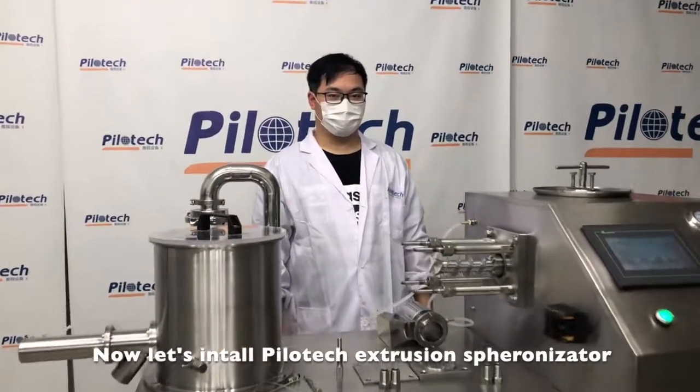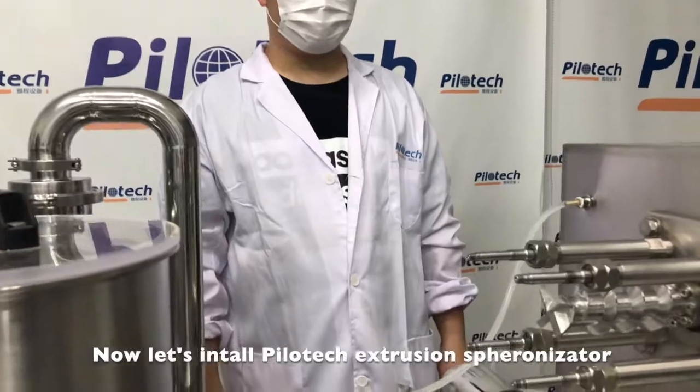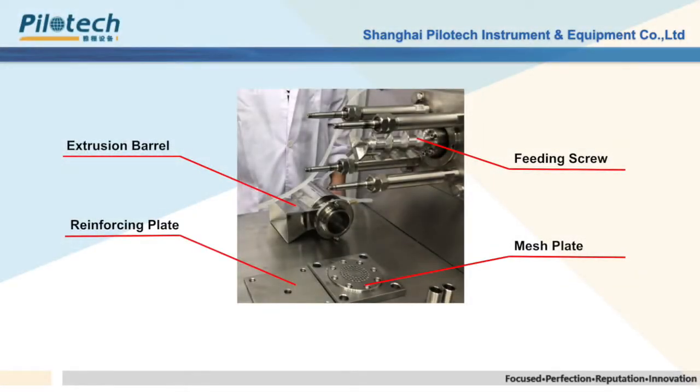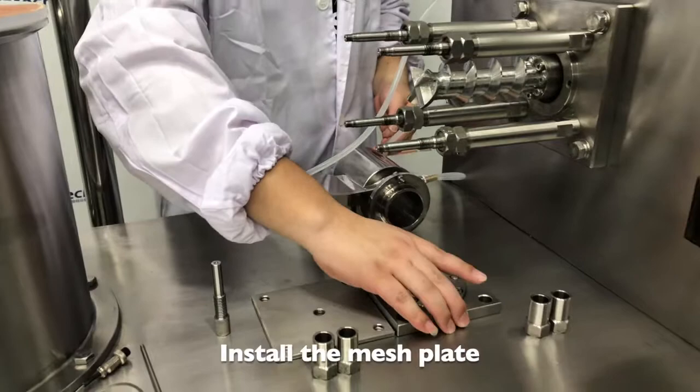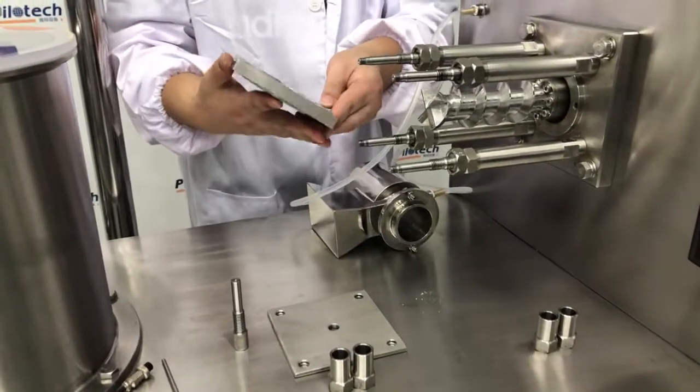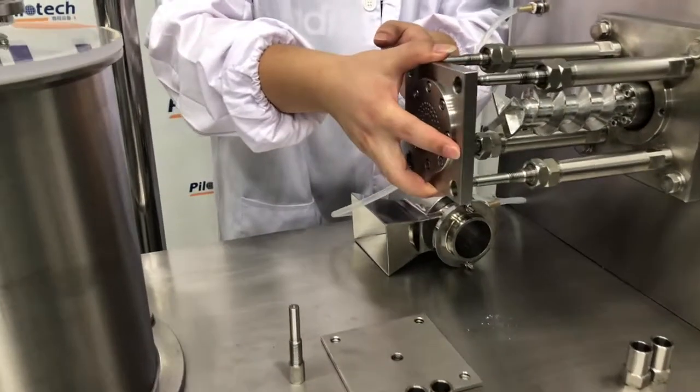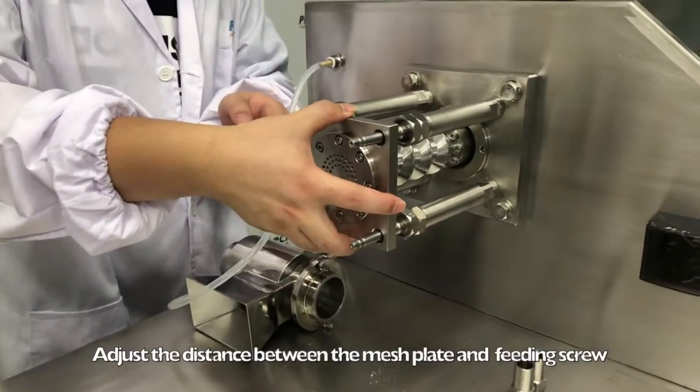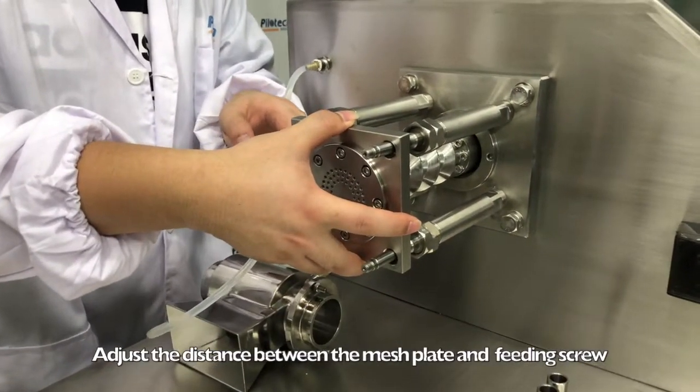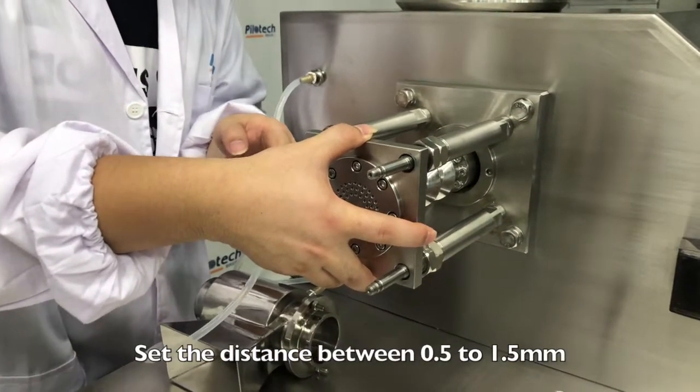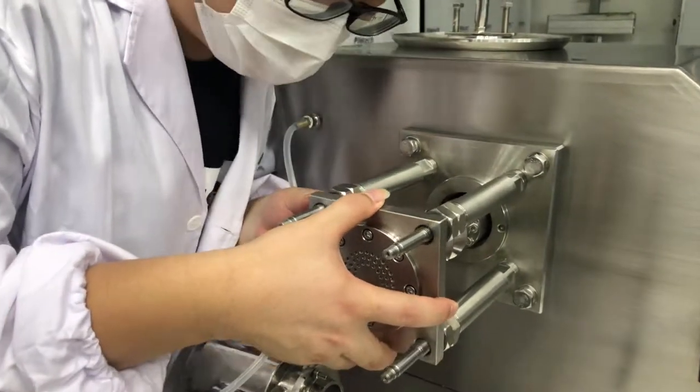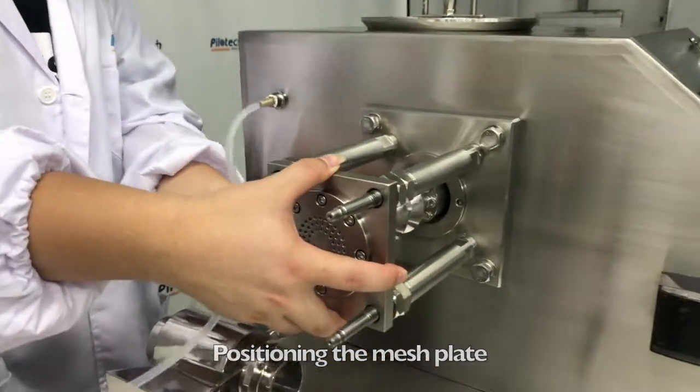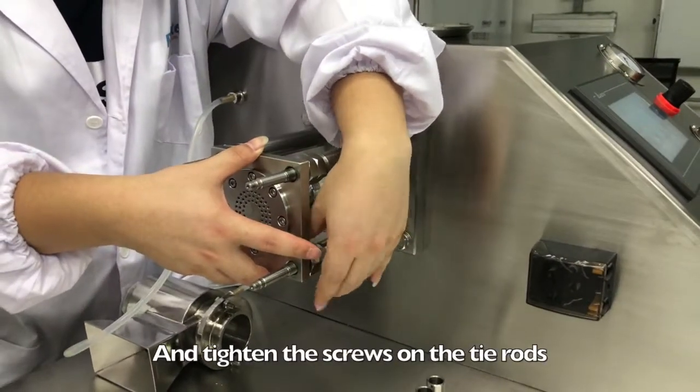Now let's install Pilotech Extrusion Spheronization machine. Install the mesh plate. Adjust the distance between the mesh plate and the feeding screw. Set the distance between 0.5mm to 1.5mm. Position the mesh plate and tighten the screws on the tie rods.